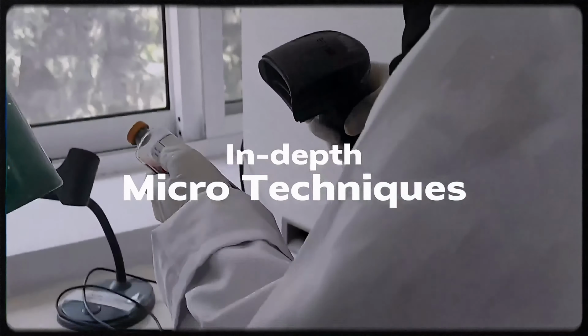What is Spread Plate Method? Objectives of Spread Plate Technique. Principle of Spread Plate Method. Requirements for Spread Plate Method. Procedure of Spread Plate Method. Result interpretation of Spread Plate Method. Precautions during Spread Plate Technique. Applications of Spread Plate Technique. Advantages of Spread Plate Technique. Limitations of Spread Plate Technique. What is Spread Plate Method?